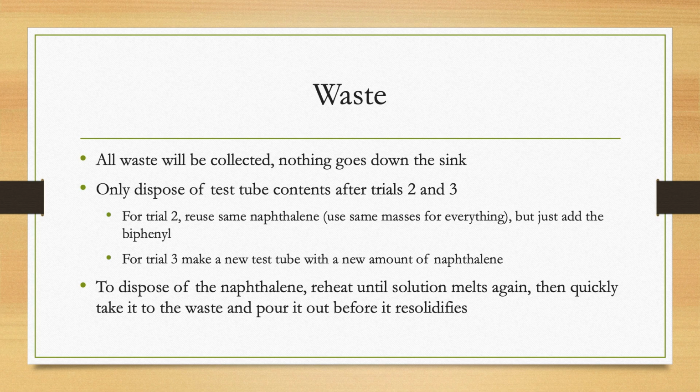And as you're doing this, try not to spill the naphthalene at different spots, especially outside the hood. The stuff smells bad enough just from heating it up and cooling it down. If you start to spill it in other places, then it's just going to spread the smell all over. So everyone has to suffer through it equally. So do take caution while handling it all throughout the lab, so that hopefully it doesn't get worse for people throughout the week.